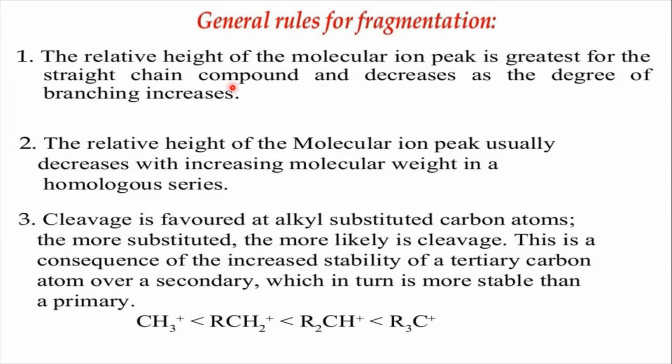So, the relative height of the molecular ion peak is greatest for the straight chain compound, whereas it is less in the branched chain compound as the degree of branching increases.